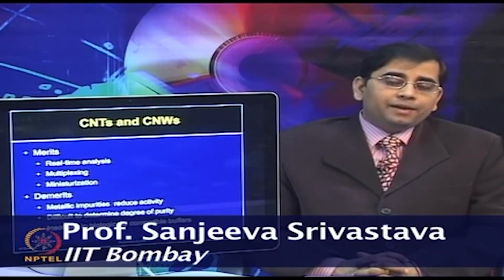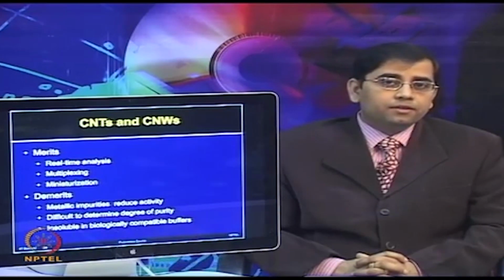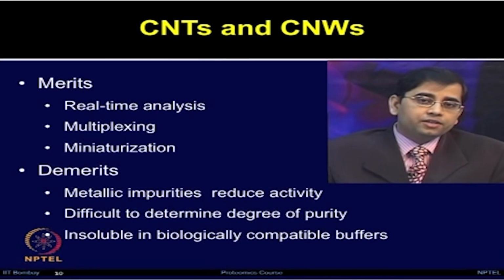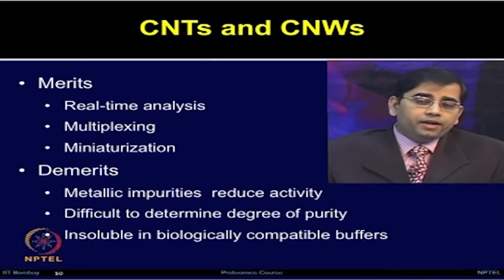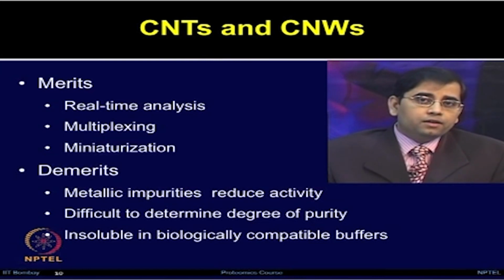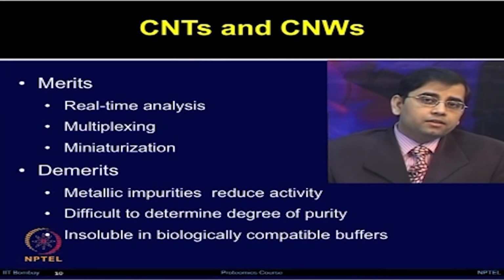They allow real time analysis similar to what we talked about in some of the previous label free techniques including SPR, where we have the opportunity to monitor the reaction in real time, which is not the case with the label based detection techniques, which are mostly endpoint assays. Now, here we can monitor how reactions are changing, and one can actually change the experimental condition in real time to modify the binding. This also provides the multiplexing capability and gives miniaturization.